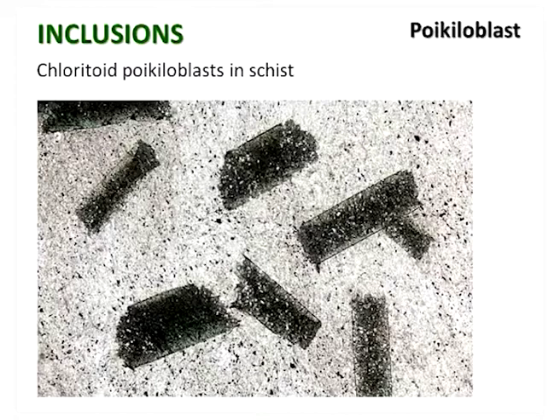And these are very similar poikiloblasts again, so they look pretty much undeformed themselves. The matrix of the rock looks pretty much undeformed. Well, there might be a very, very faint fabric running north-south, but it's really, really subtle. I don't know if I'd even be sure of that. And again, the inclusions within those poikiloblasts are not really aligned. So far all they're telling you is something about the way that the crystals grew, and that these probably grew quite late on in this rock's history, and just overgrew the original groundmass.